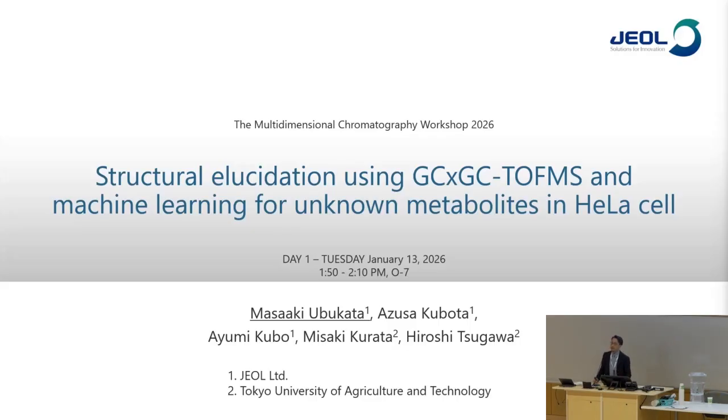Last time I explained our AI structure analysis functionalities in the software. Today I will explain again our AI structure analysis technologies, and I also bring one more AI tool for chemical formula recommendations. I will explain it, and after that I will explain our metabolomics applications.